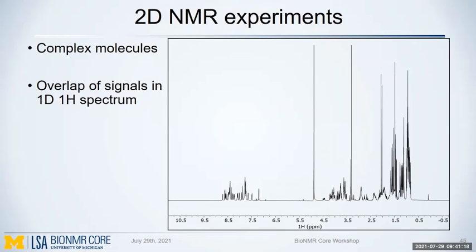Okay, so then we will just move on to those 2D NMR experiments. And once I'm done with the 2D NMR experiments, we will go ahead and have a hands-on session on using those IconNMR to set up some of the experiments we mentioned in the workshop. So when will you move on to 2D NMR experiments?